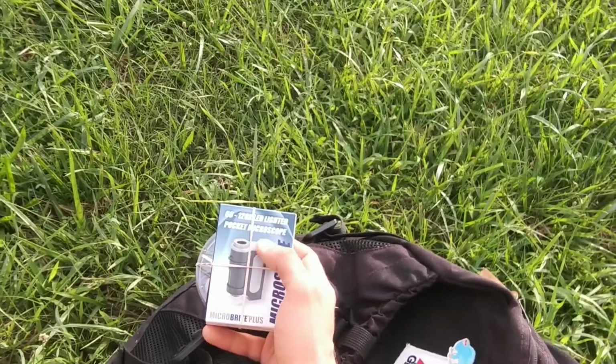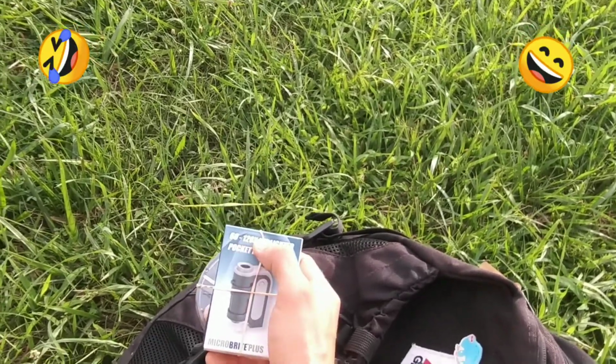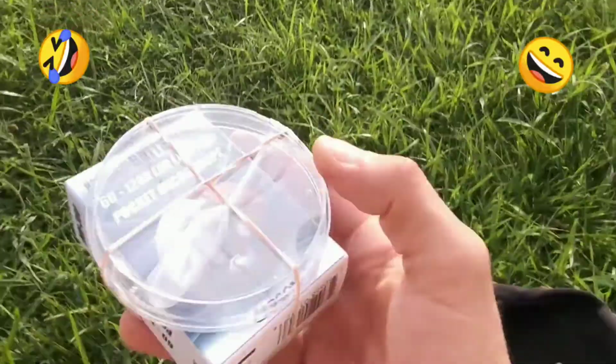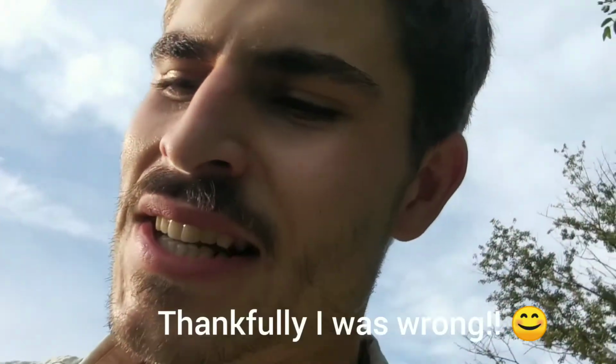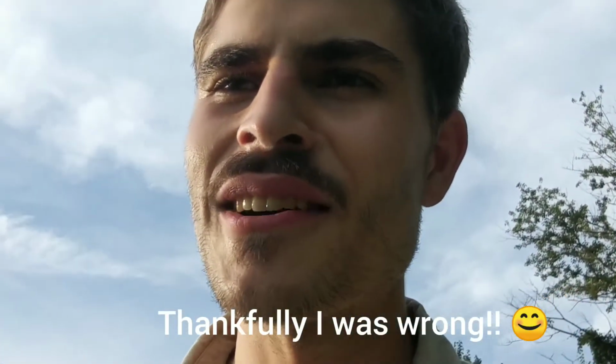This was like 20 bucks online. It's just a little mini microscope. And this is left over from summer school. And so we're gonna go see, I was doing some research. I don't think that my magnification, 60 to 120 times, is powerful enough to see microbes. I'm a biology student along with the meditation stuff. But we're gonna give it a shot, so let's give it a try.